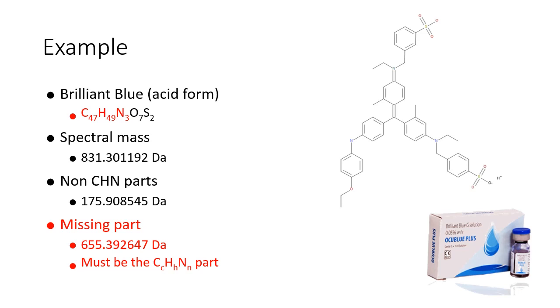And now the Dromey Foyster algorithm uses its cunning trick. Because CH2 and nitrogen have very similar masses, it's possible to calculate a nitrogen-free formula that will be very close in mass to the real formula. So the next stage of the calculation now is to work out the formula of this nitrogen-free molecule.